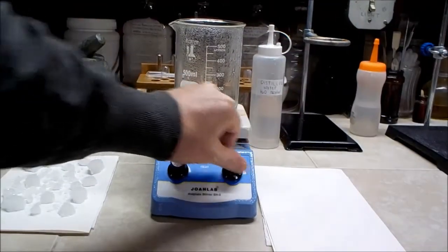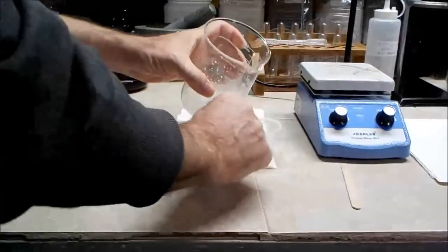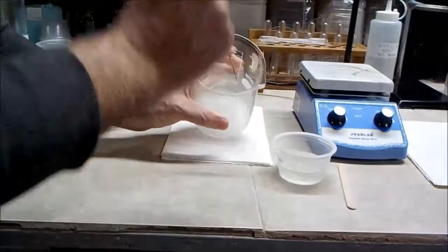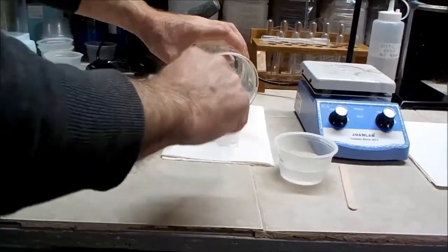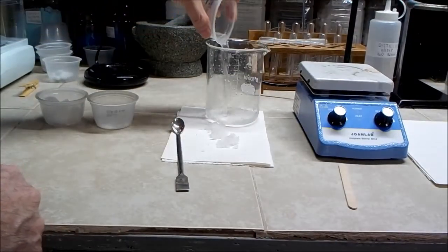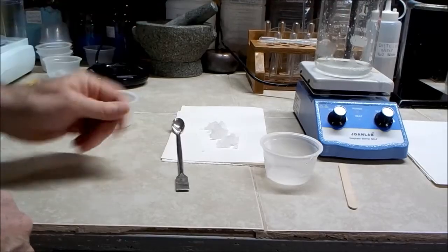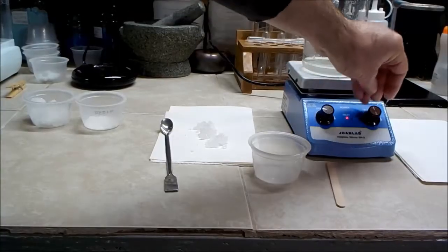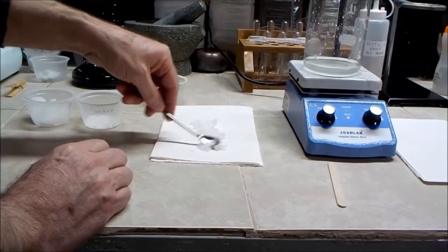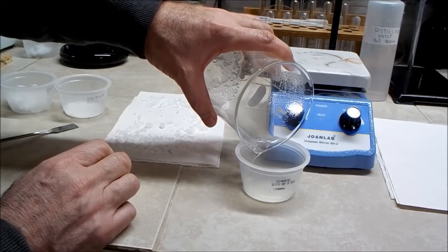After removing more of the water from the remaining solution I set it aside to cool. After an hour or so I see more crystals have formed. I want to recover as much product as possible so I go through the process one more time. This time there is very little solution remaining and it will be discarded — any remaining impurities should be in this liquid.